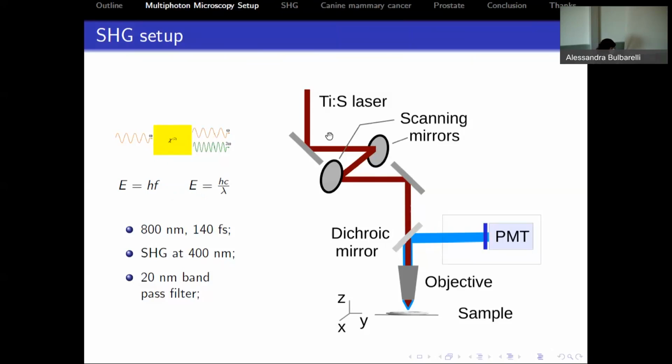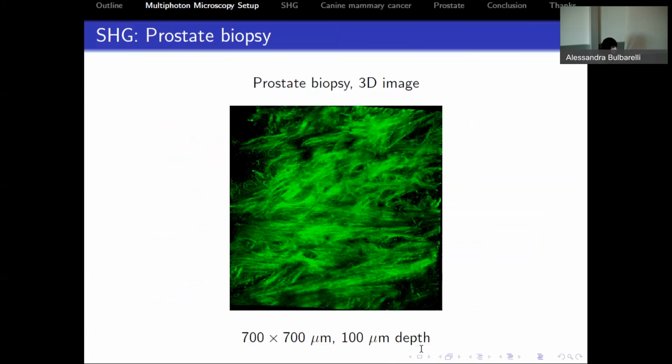And so in the microscope, what we did is put that extra detector just on top of the objective. And so we can collect, in the same position of the sample, the fluorescence and the second harmonic, and it's not shown here, but we can also collect the transmitted image through the biopsies. And so that is just to show an example.